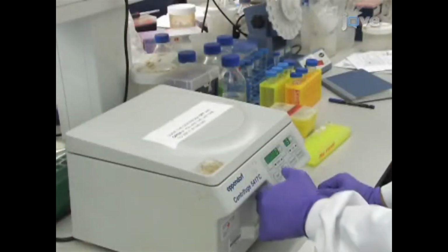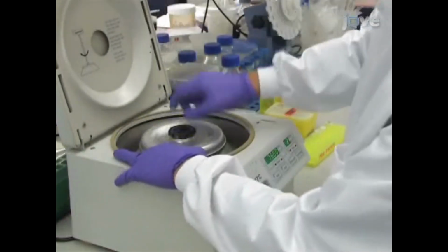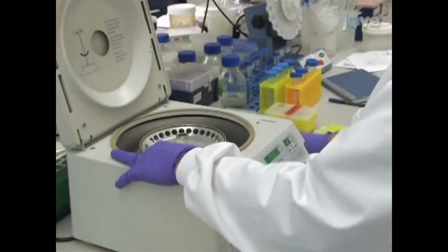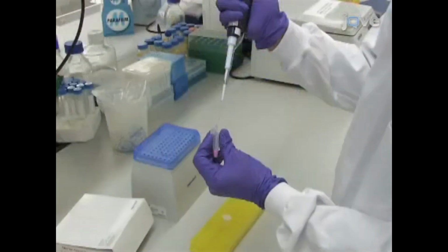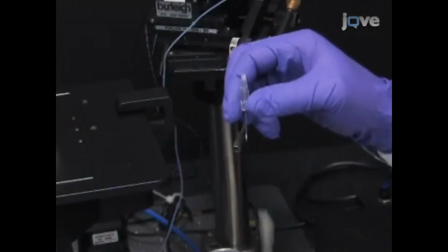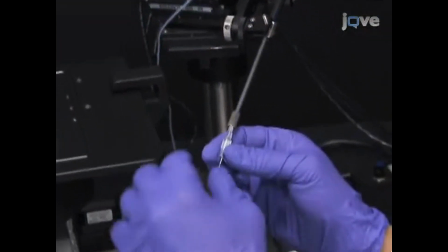Prepare the solutions to be injected by briefly centrifuging them at high speed. This will pellet any solid deposits that might block the injection needle. Then, load the injection needle with a loading tip and carefully attach the loaded injection needle to the injector.